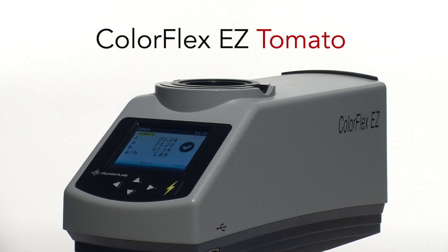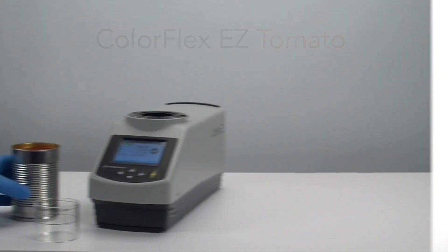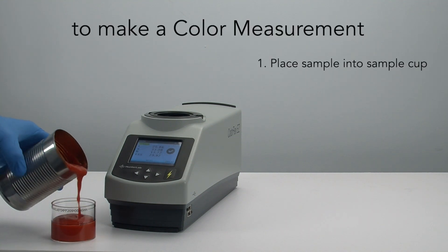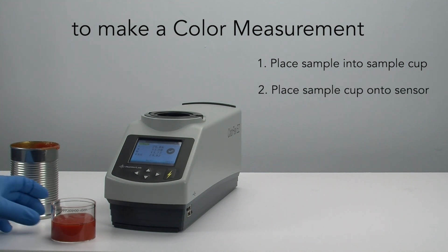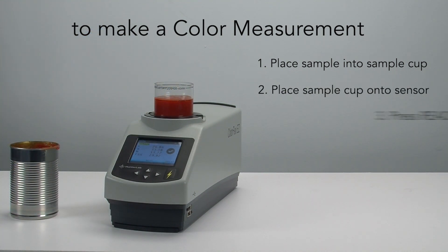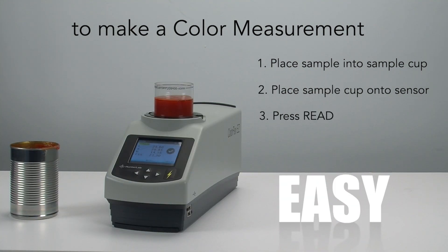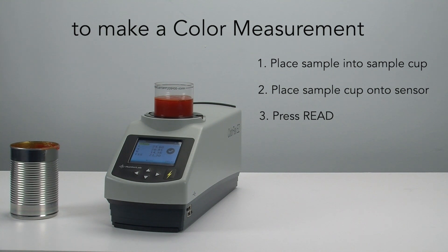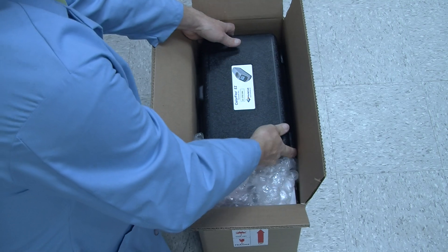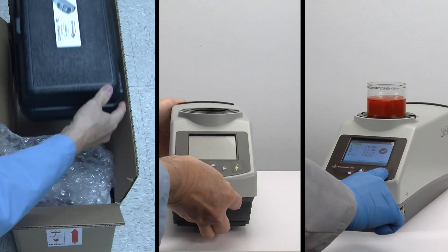First and foremost, its extreme ease of use. To make a color measurement, simply place your sample in the sample cup, place the sample cup onto the sensor port, and press Read. It's that easy and quick. This extraordinary ease of use also benefits by providing a much easier and shorter learning curve for operation. In fact, many new purchasers report taking less than 30 minutes from unpacking a new unit to set up to measuring samples.